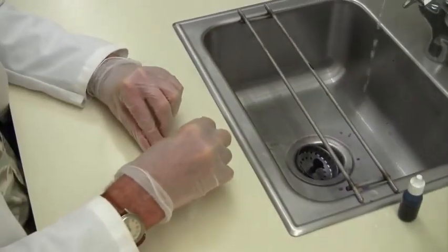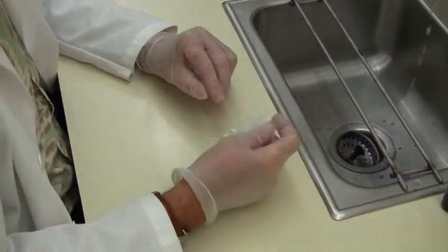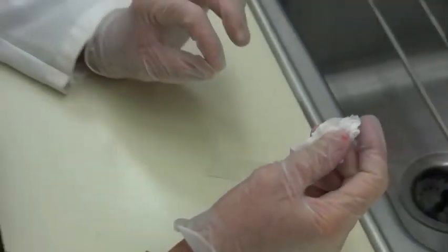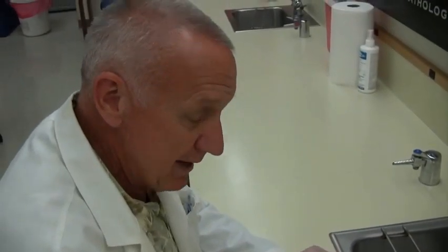And then you're going to look at the slide under the microscope using low power and then high dry, and then you must use oil immersion to see the small acid-fast bacilli, which will appear reddish, and the non-acid-fast bacilli will be blue, and all of the background material will be blue also.